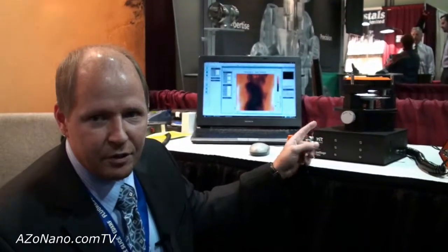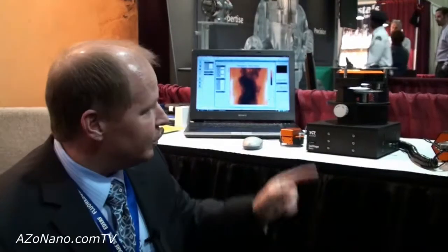Here next to me we can see the demo measurements, and this will also be visualized on the laptop next to me, so you can see the topographic map of our sample. We are right now measuring here at MRS.